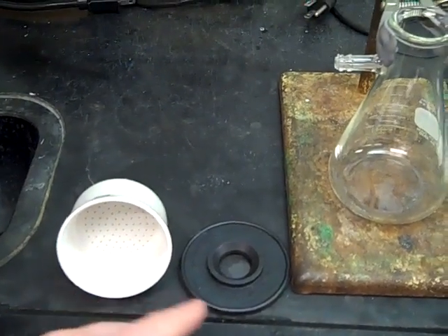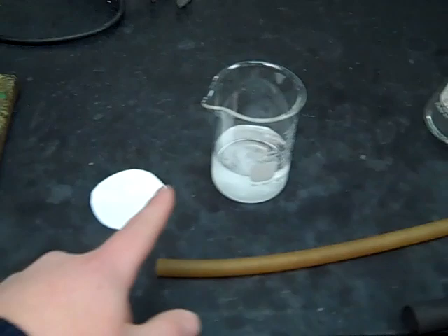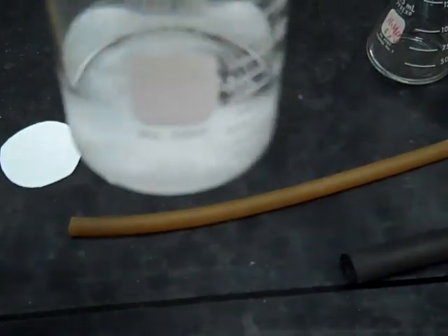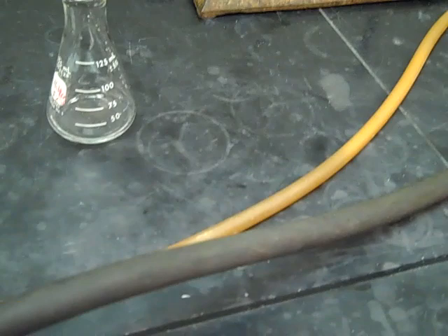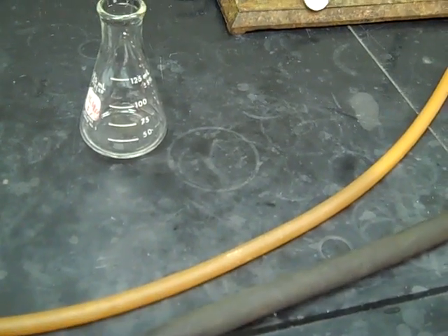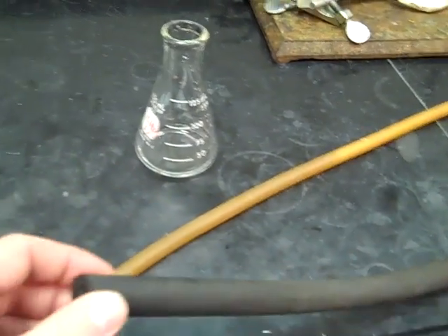We've got a Buchner funnel, a filter vac, a vacuum flask, a pre-cut piece of filter paper, our material to be filtered — you can see we've got some white solid down there at the bottom — a little bit of very, very cold solvent, and then we've got two hoses here. The black hose is made for vacuum, so that's what we'll be using. The yellow hose is only used for water, so if you see it in the lab, you're going to avoid that and go just for the vacuum hose.